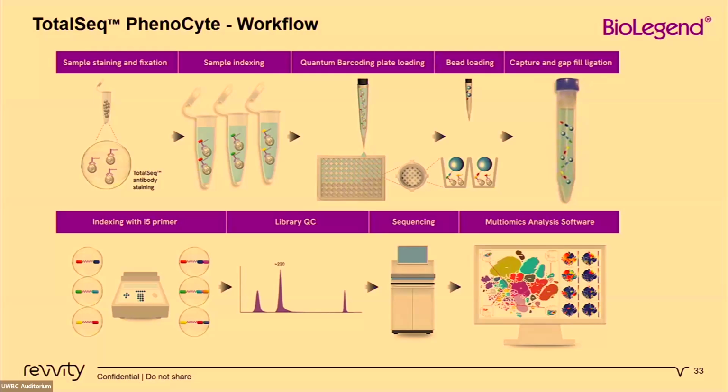Then you'll take your labeled cells and do some indexing with the provided I7 indices from the kit. If you use this 200,000 kit, you'll have 16 different tubes. They each have a different I7, and you're just going to aliquot your mix of cells across all of those different tubes. Then after those are labeled, they will be mixed all together and loaded onto this plate.